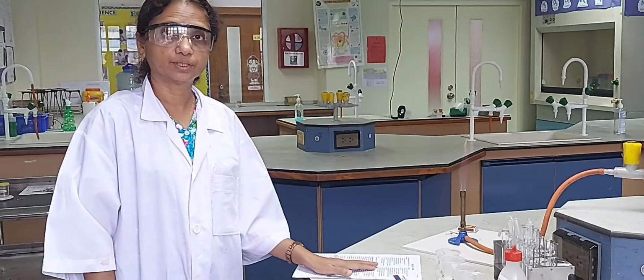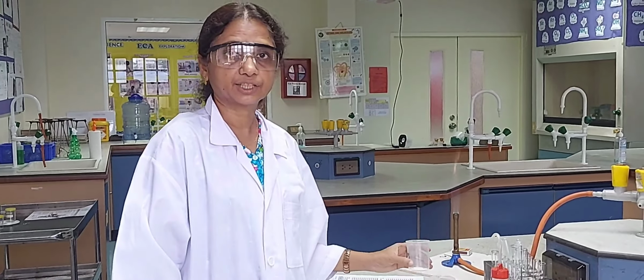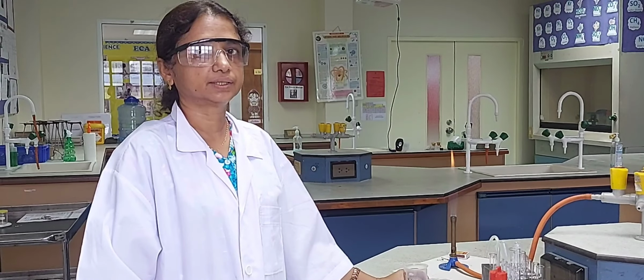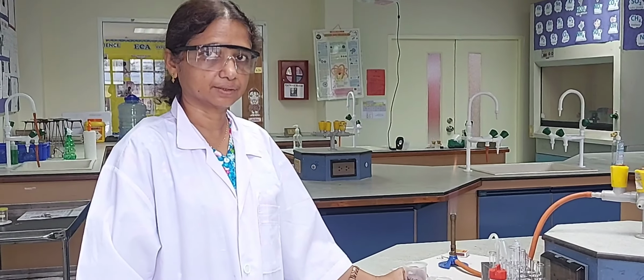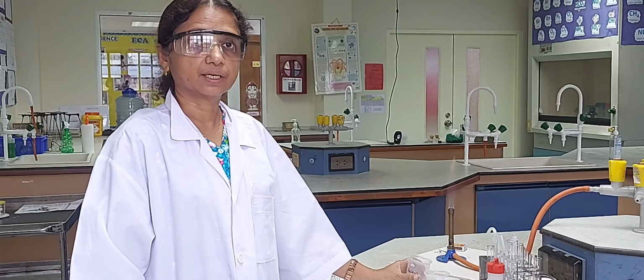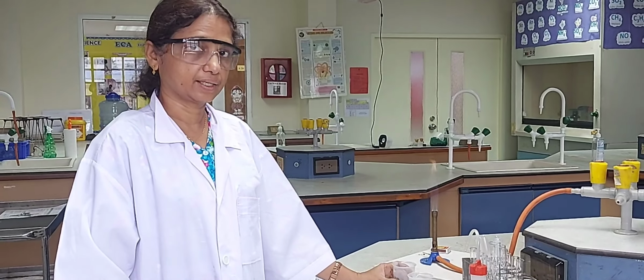Everyone, today we are going to do a practical in which we will study the reactions of bases. You know that bases are oxides and hydroxides of metals, and we have to see their solubilities. If a base is soluble in water, then it becomes an alkali.